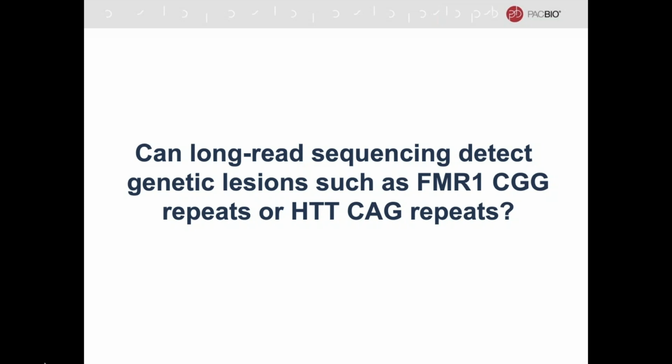The random error mode that Kristin described earlier that PacBio sequencing provides does not stumble on a lot of these types of repeat contexts within the genome, which means you can cleanly resolve them. The last one I want to mention as a use case is we've also sequenced the C9orf72 repeat. So this is a G4C2 hexanucleotide repeat associated with ALS. And we've actually done whole genome sequencing on an ALS patient and found an over 900 repeat locus there.